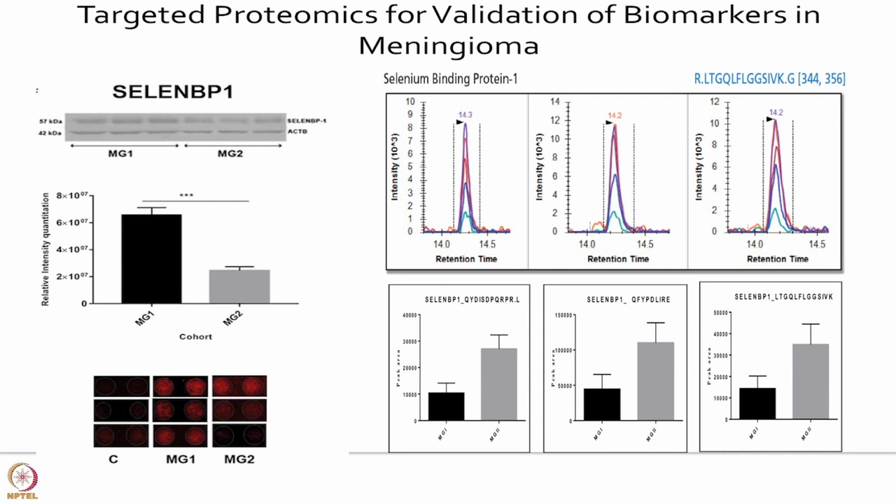Then we can measure several peptides and try to monitor their progression in the mass spec, look at their intensity, and utilize that information for protein quantification.